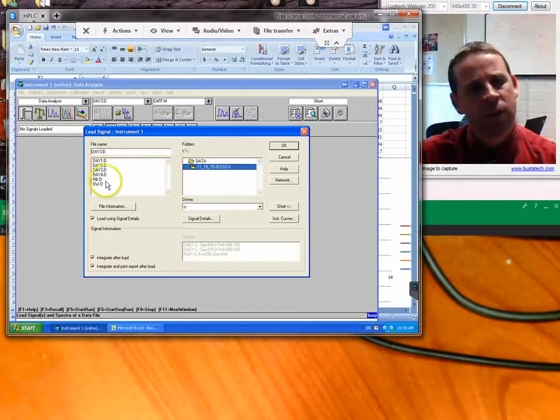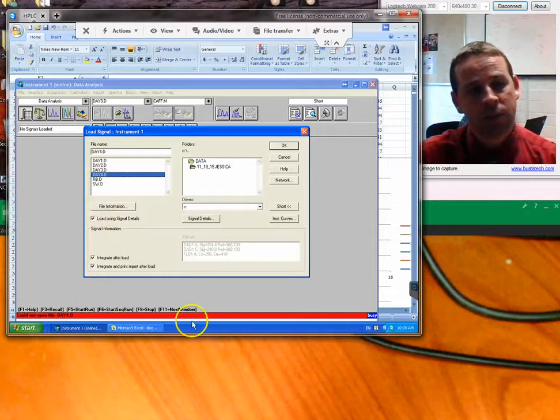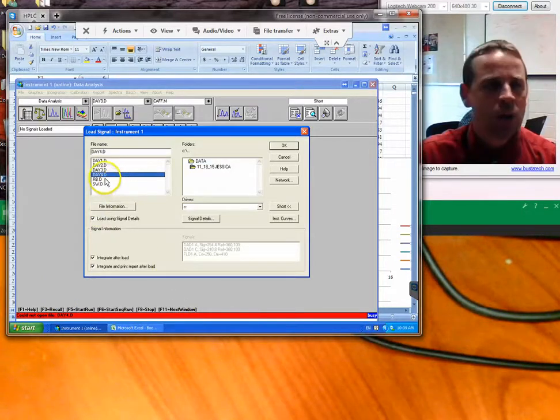Now day 4 is the most recent one. It's the one that's being collected right at this moment. So if I try to open that one, it's going to give me a red line, which is saying it's not quite finished loading. These other ones I can open, and I'll start with this RB right here.